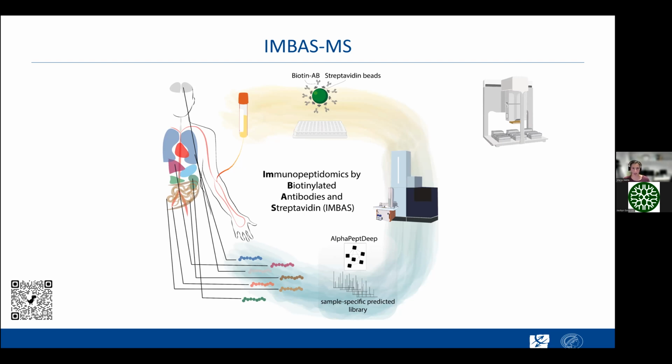Again, there you need to be really careful to adjust your method setup to immunopeptides and not just a standard tryptic method here, because they're just behaving really differently. So other vendors are an option, other mass spectrometers are an option.